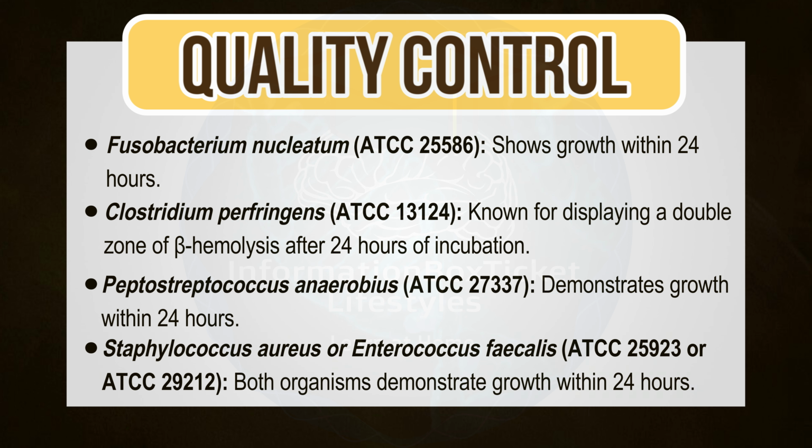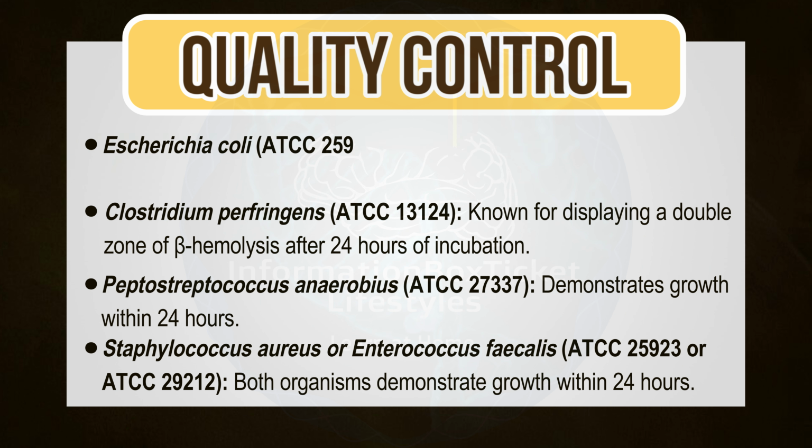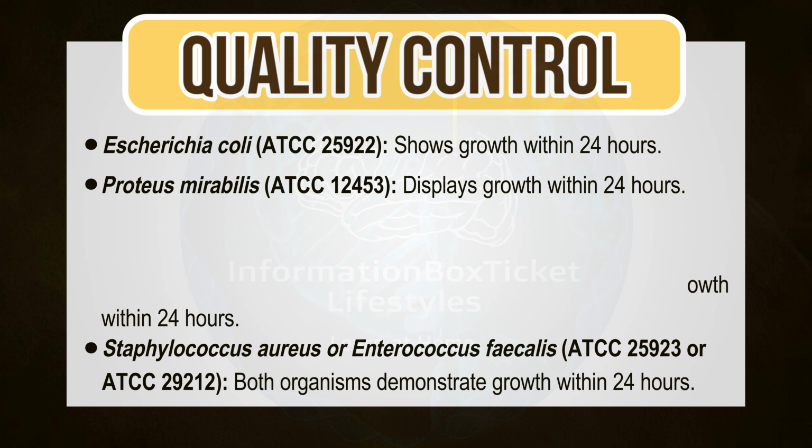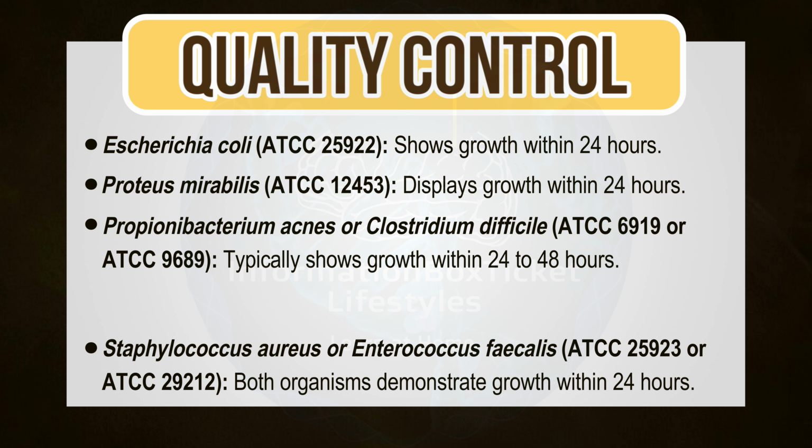Staphylococcus aureus or Enterococcus faecalis, ATCC 25923 or ATCC 29212. Both organisms demonstrate growth within 24 hours. Escherichia coli, ATCC 25922, shows growth within 24 hours. Proteus mirabilis, ATCC 12453, displays growth within 24 hours. Propionibacterium acnes or Clostridium difficile, ATCC 6919 or ATCC 9689, typically shows growth within 24 to 48 hours.